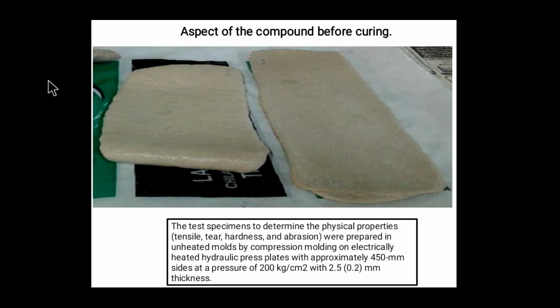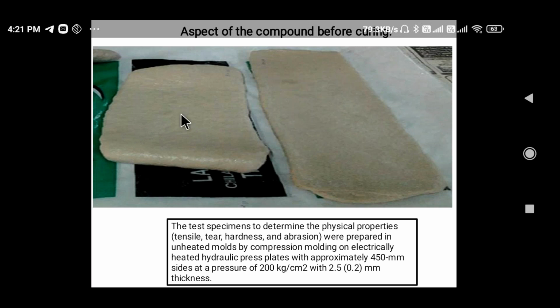This is the appearance of the compound before curing. Immediately when you take it out of the two roll mill, we get it like this.